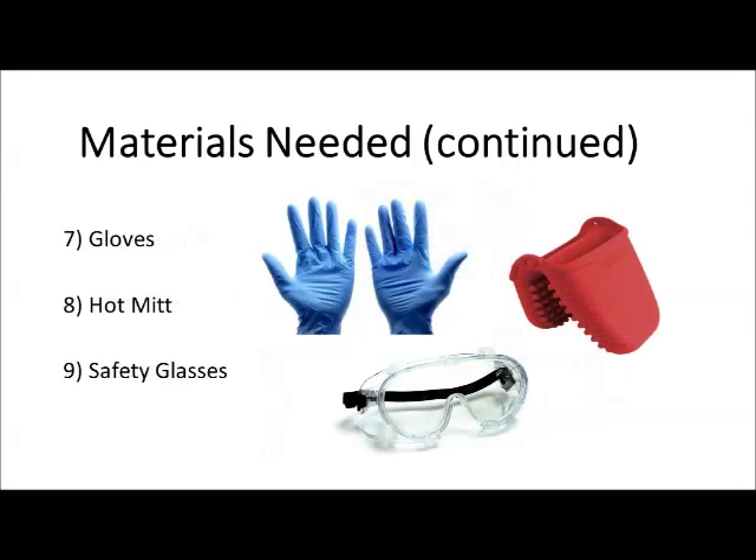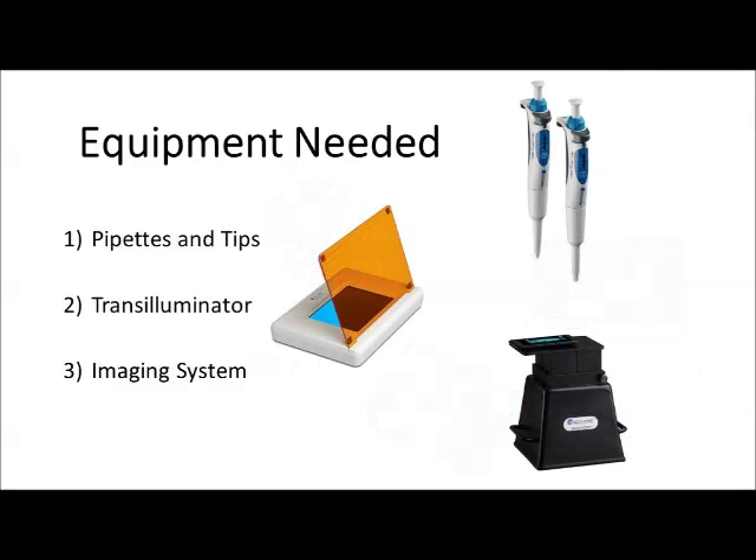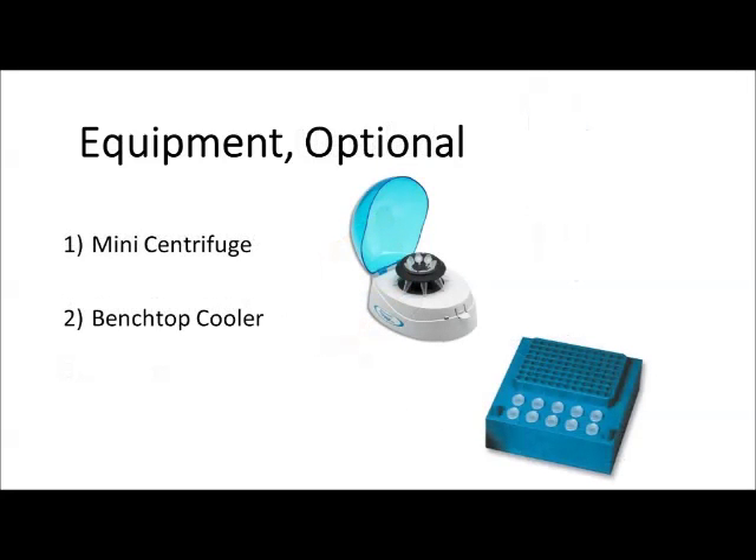For laboratory safety, we'll be using gloves, a hot mitt, and safety glasses. For equipment, we'll need a laboratory balance for weighing out the agarose powder, a microwave for heating up the agarose solution, and a power supply and gel box for the electrophoresis separation. Additional equipment includes pipettes and pipette tips, a transilluminator, and an imaging system. Optional items include a mini centrifuge and a benchtop cooler for keeping temperature-sensitive reagents cold on the lab bench.